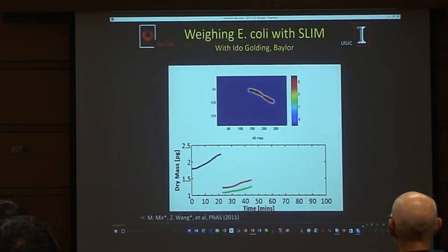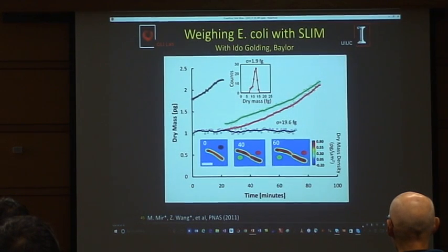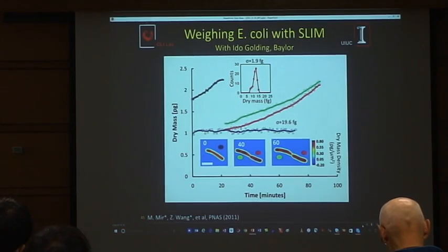Maybe some of you are familiar with Scott Manalis's work, where he's weighing cells with a vibrating cantilever, which is very nice, but it has the limitation that you have to keep flowing the cells through that channel, through the cantilever. In principle, it would be nice to have the ability to look at cultures of cells, both single cells, both flowing or touching, or look at the effects of touching one another and so on.